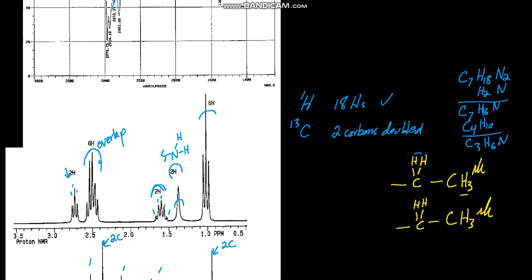Because these two methyls are completely and exactly equivalent, it suggests that these two carbons are in a very similar chemical environment as well. So they're not triplets, and so they could be quartets. Could it be that there's a quartet under there? A quartet usually looks like this. It does kind of seem like that. It's like 3 of the 4 are there. And then if that's true, what's overlapped with it almost kind of looks like a triplet there.